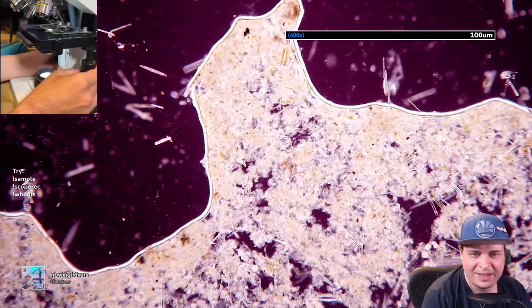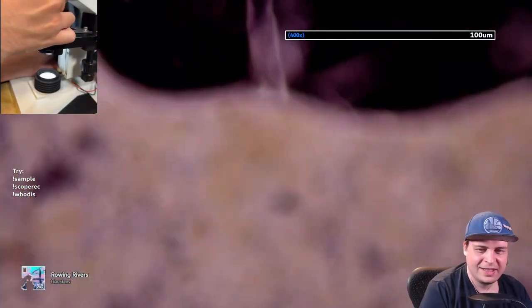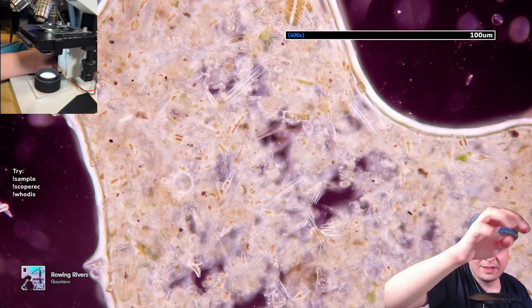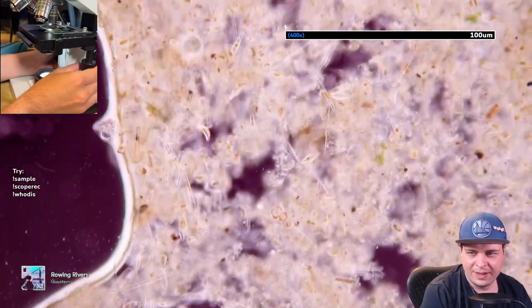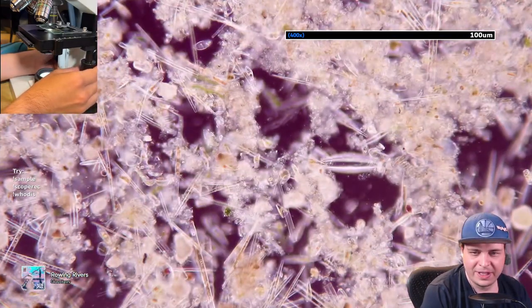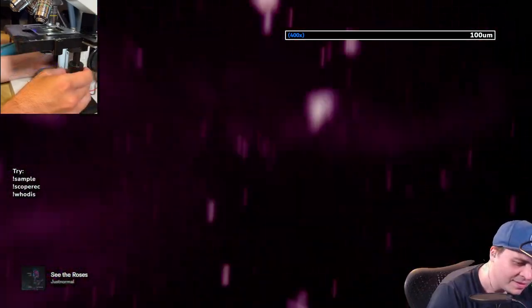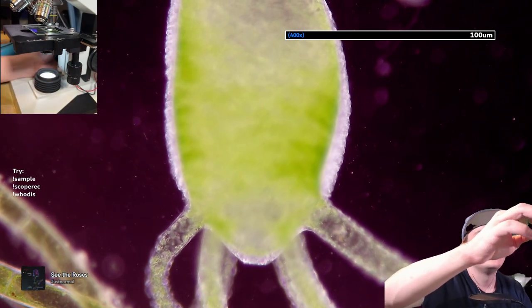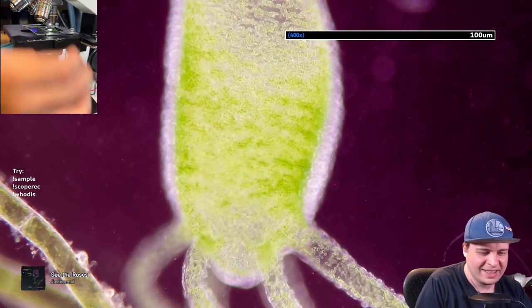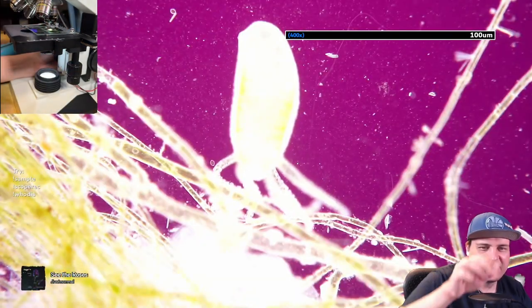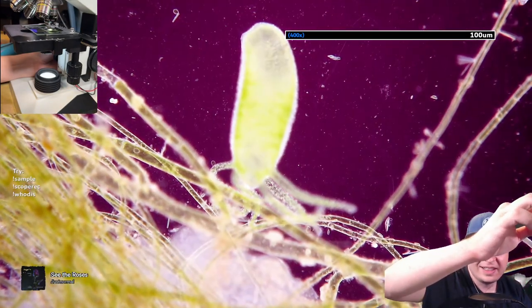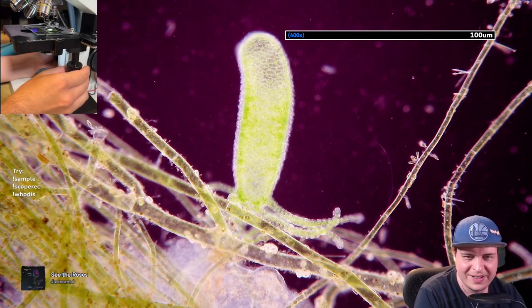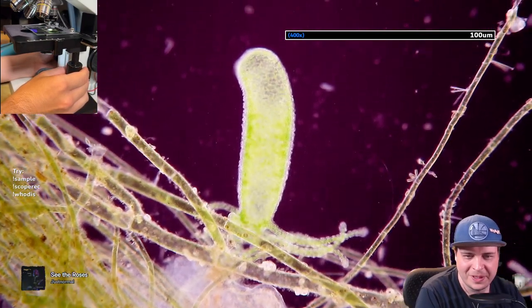Look at this! I like purple especially when you're looking at green stuff — purple and green with the hydra. Pretty cool.